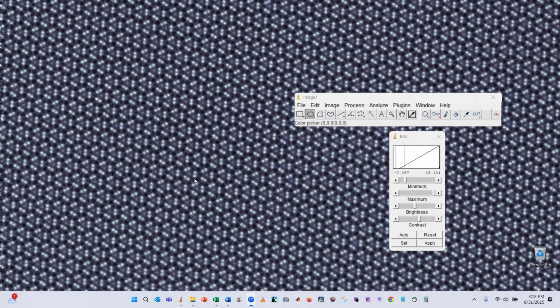And I'm doing a retake of this video about doing the calibration for the EMPAD and the saturation current calculation, because I realized I could do a couple things better. So we're going to go through this again, hopefully streamline things a little bit. I did the videos already about collecting the EMPAD data and then visualizing the EMPAD data. The visualization in particular, after I did that, I realized I needed to retake this video about doing the calibration. So, we're going to do this today.